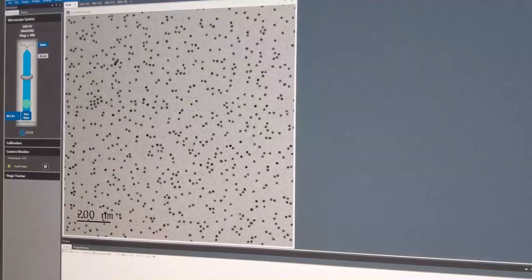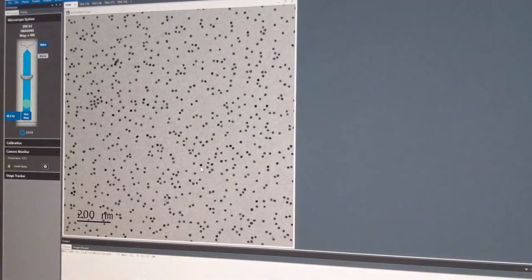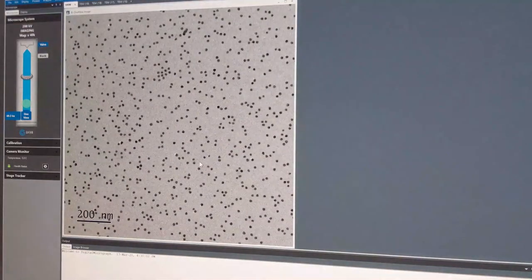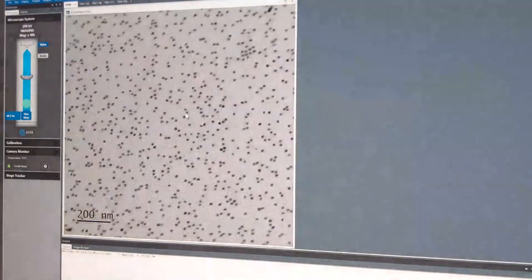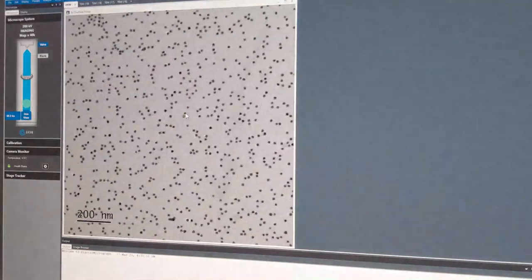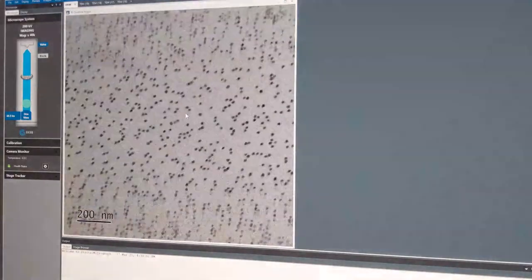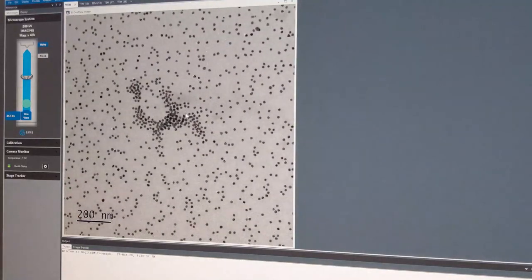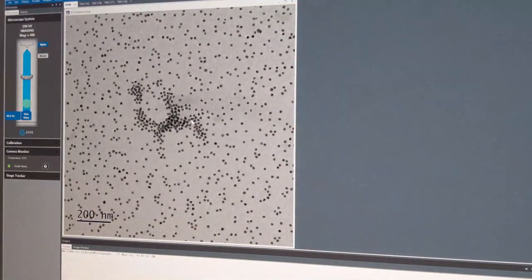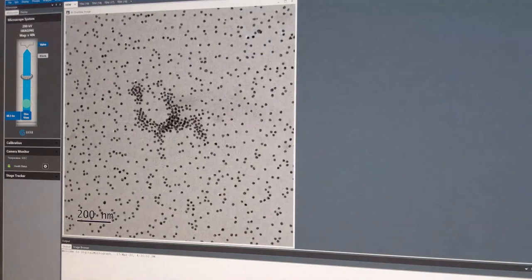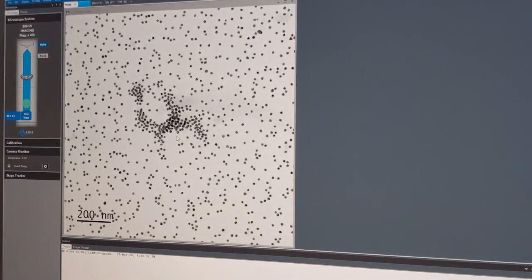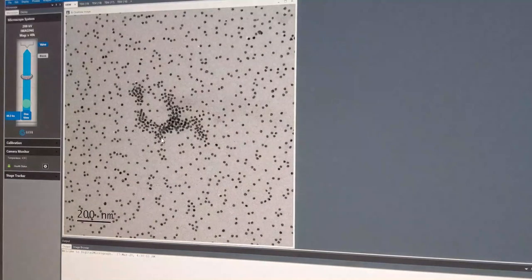Looking at the scale bar, I think the particles are roughly around 10 nanometers. To me, they look like they are monodispersed — all having roughly the same size. We can see this region here where the particles are more dense — I'll take an image of that. In this region it's not so good for size determination.